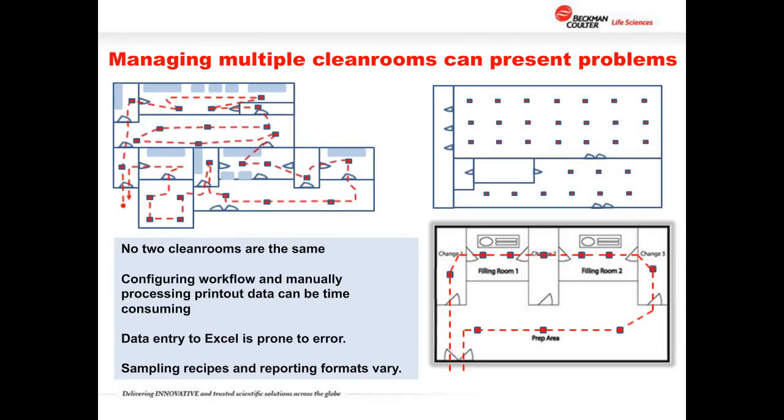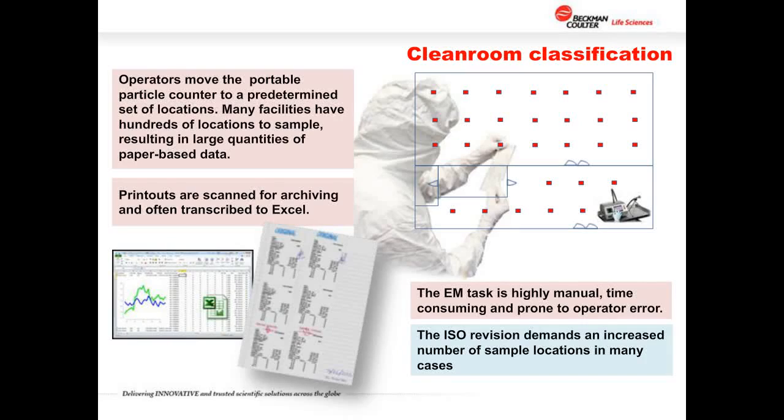First off, of course, is orchestrating the flow in an effective way and being able maybe to incorporate that into the instrument so it's a planned movement to make that more efficient in the process of moving through the various 9 points that are there under the new system, and maybe figuring out a way to minimize the reporting side of it. You're still going to have to go out and sample at each and every point. The demand then, of course, at the end is I have to create a report and file information. Can we speed that up? And the answer could be yes.